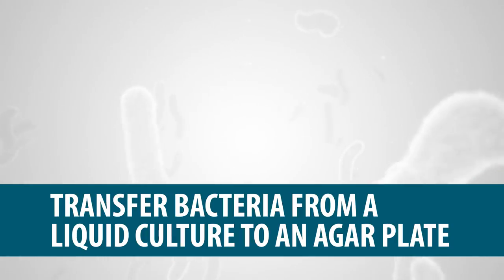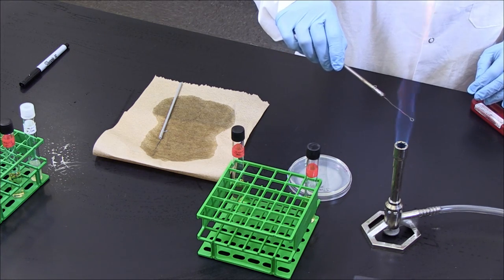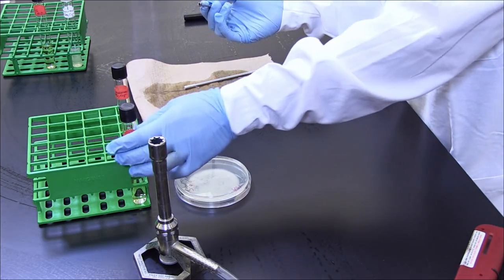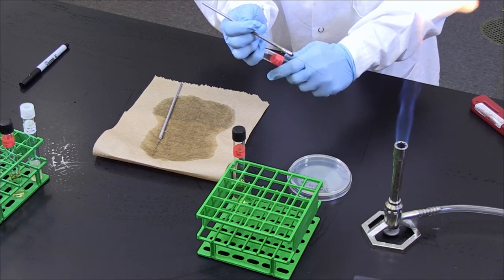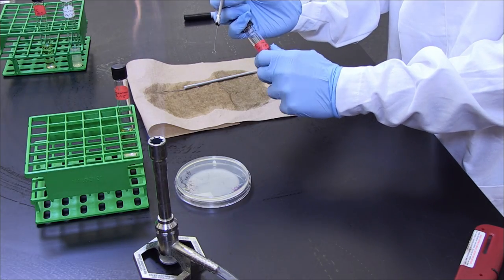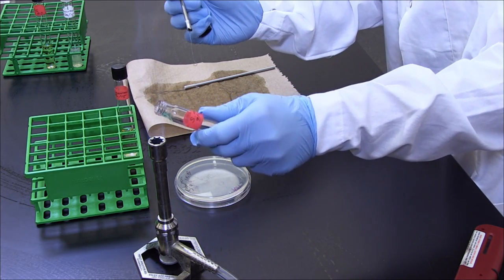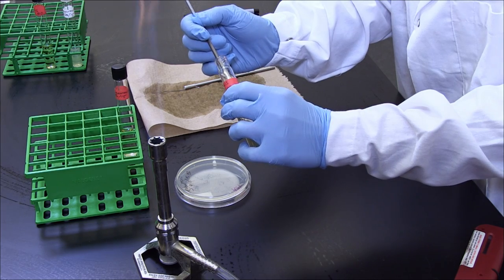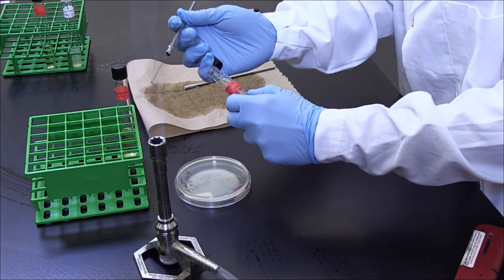Transfer Bacteria from a Liquid Culture to an Agar Plate. Your dominant hand should hold the sterilized inoculating tool, and your other hand should hold the bacterial culture. Use your dominant hand without interfering with your inoculating tool to remove the cap of the test tube of the liquid culture, and pass its mouth through the flame several times. The inoculating tool is then dipped into the liquid culture and removed. Sterilize the mouth before replacing the cap.